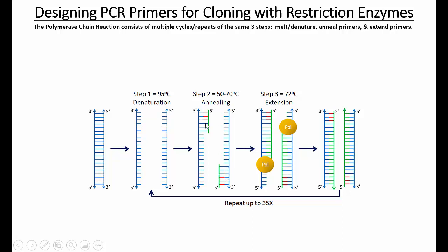All right? So the key here is that these primers are relatively short. They're only about 20 to 30 bases, so they can anneal at this elevated temperature. And on the 3' end here, they are perfectly complementary to the target sequence. So that's how we define which stretch of the template we want to copy. We're going to have one forward primer here that binds to, let's say, the beginning of our target sequence, and another reverse primer that binds to the end of that sequence.